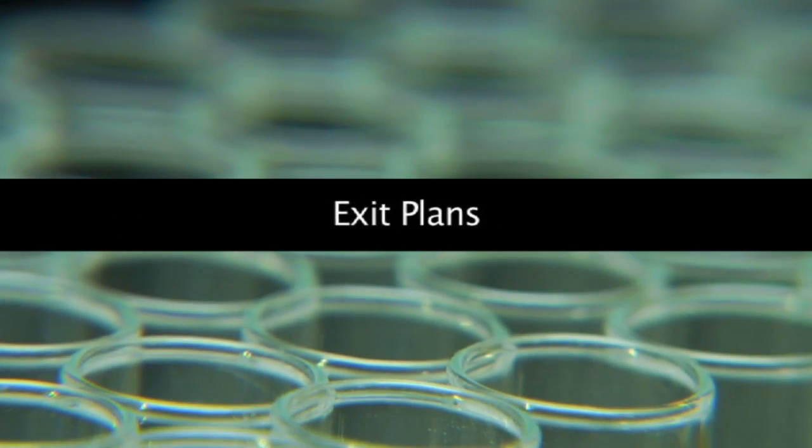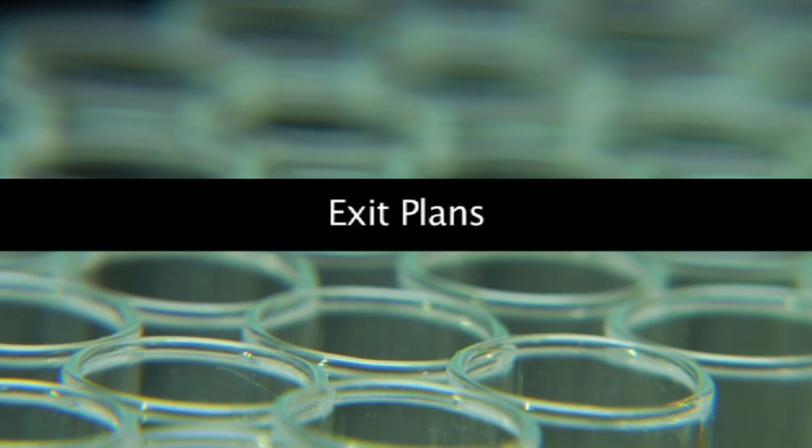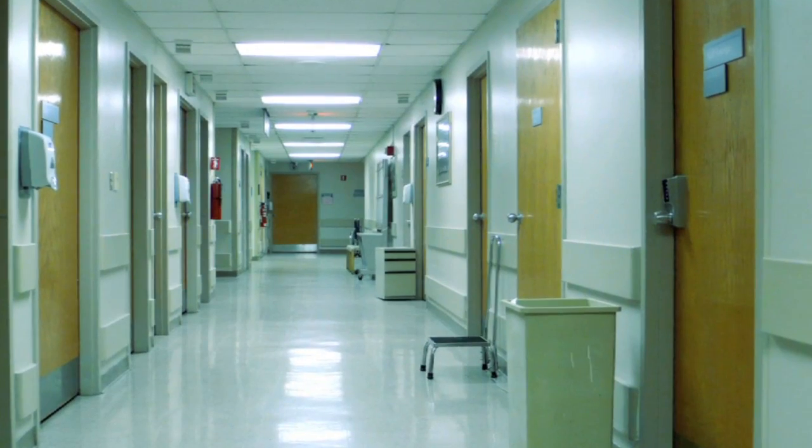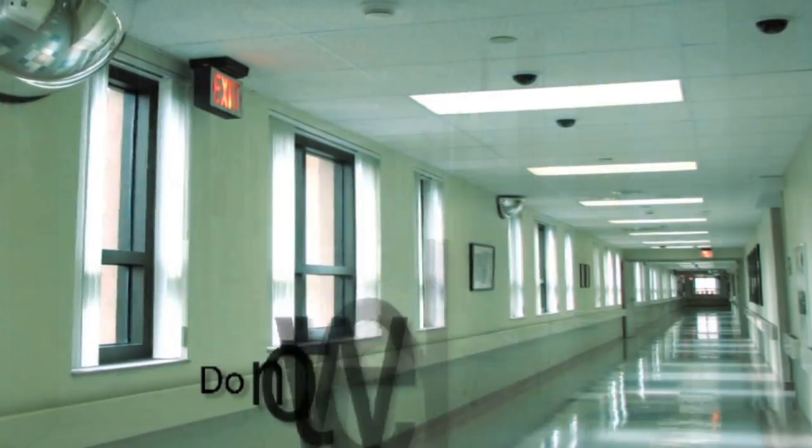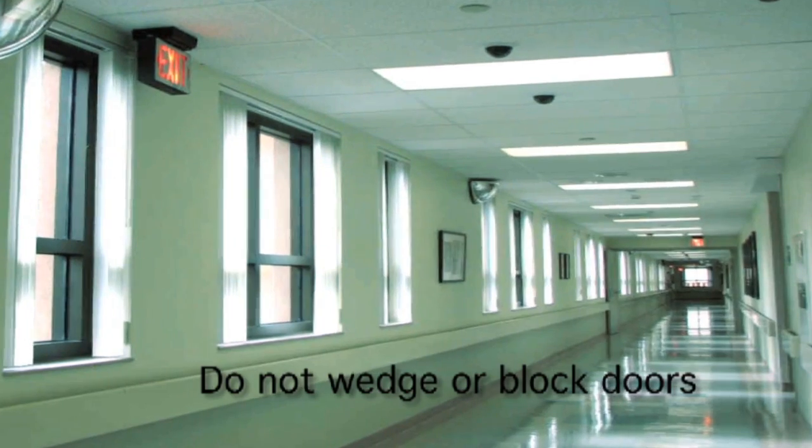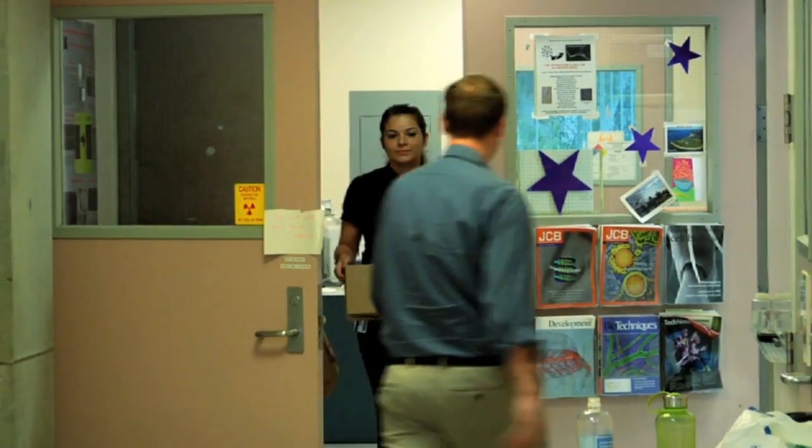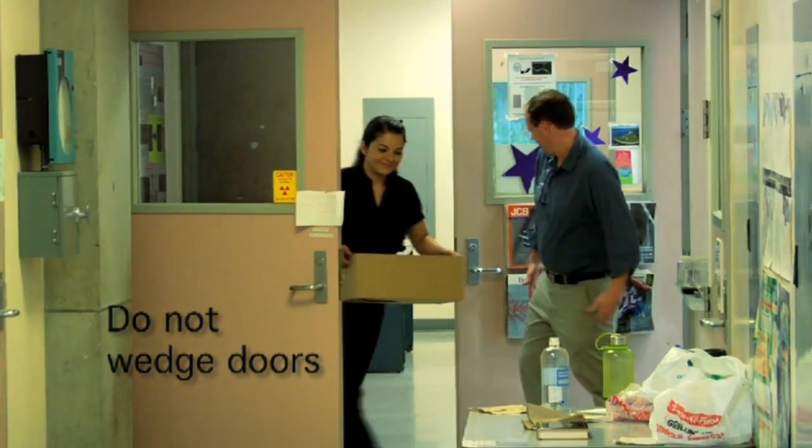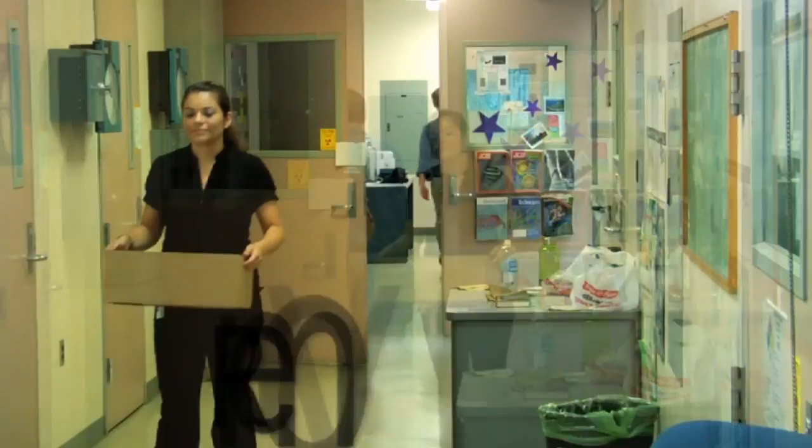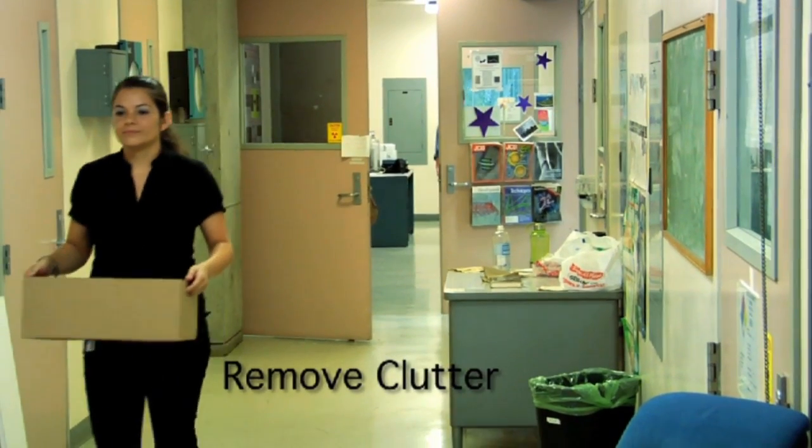Fire and life safety preparedness extends outside the lab. The corridors and office spaces surrounding your lab are vital links allowing evacuation in an emergency. In the event of a fire, wedging or blocking doors open permits toxic smoke and gases to migrate from the fire area into the exit corridor, making it difficult or impossible for occupants to exit safely. Be sure corridors are free from clutter or obstruction.